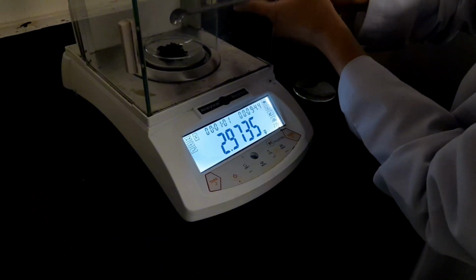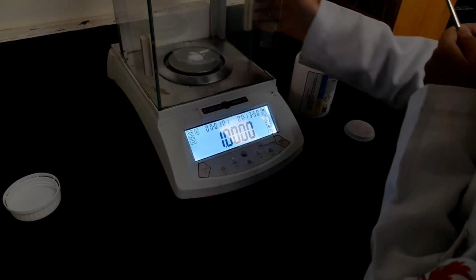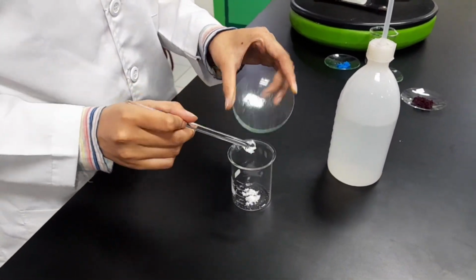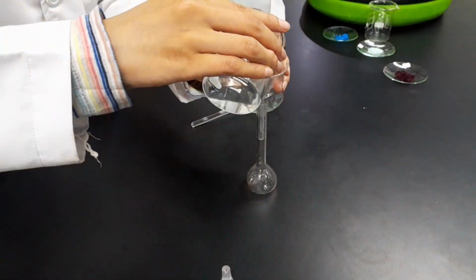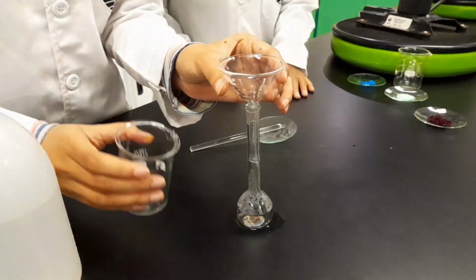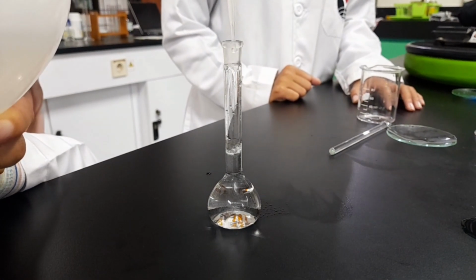First, we need to weigh all the compounds based on the result we got from the calculation. After weighing all the compounds, put them in a beaker glass, pour in a little distilled water and stir until it dissolves. When it has dissolved completely, pour it into the volumetric flask using a funnel, and after that add the remaining water needed.